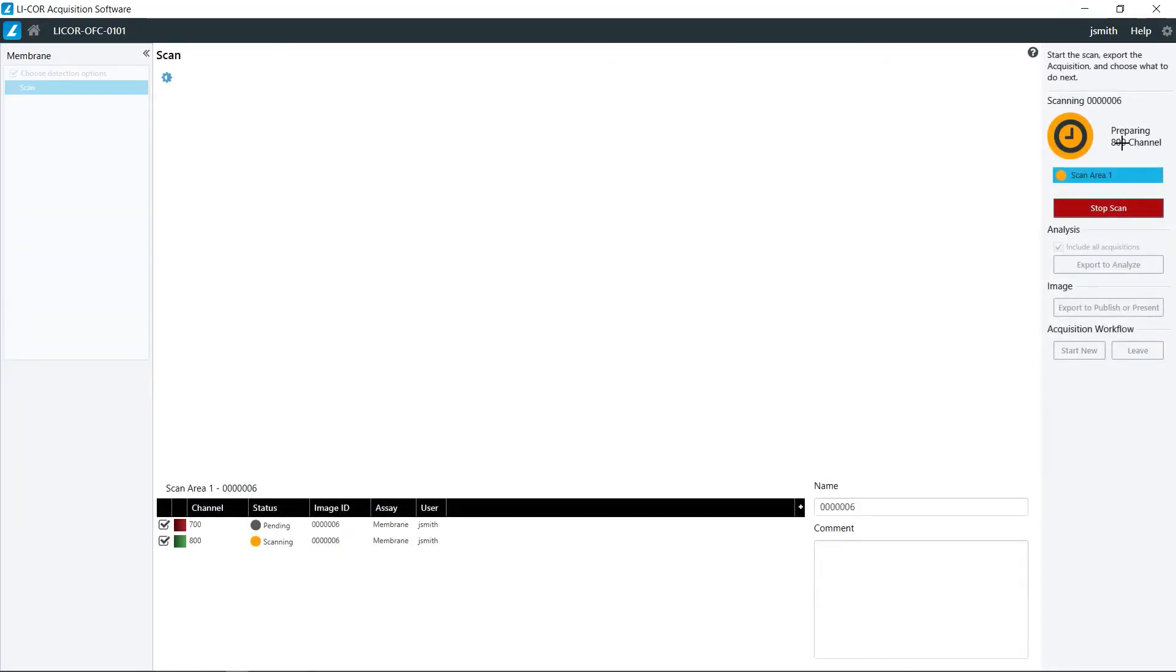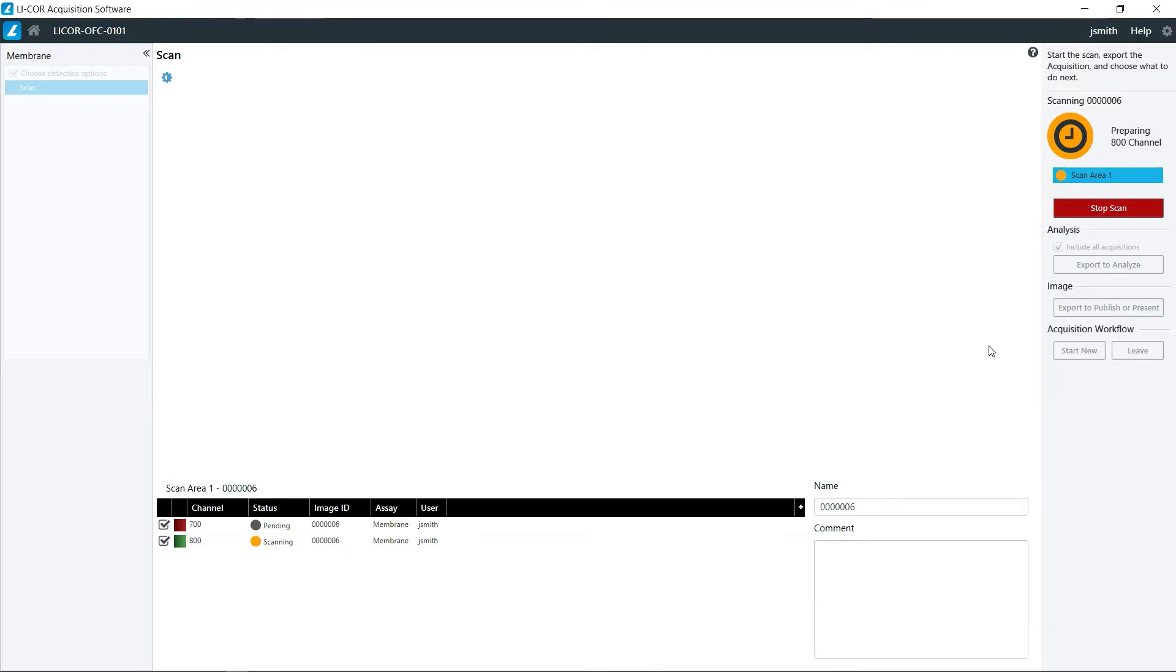Once the acquisition has started, it will give you an estimated time remaining, and it will give you a preview of the image right here. If at any point you notice that some of the settings are wrong or the membrane was not positioned correctly, you can just go ahead and click stop scan at that point.